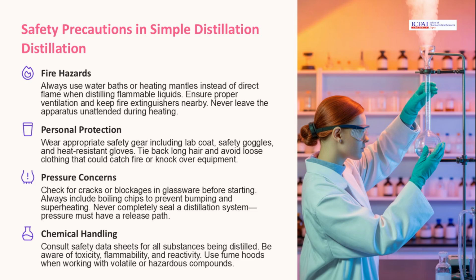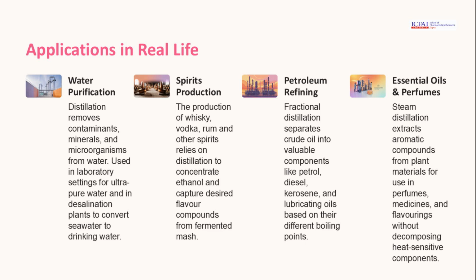Safety precautions in distillation include fire hazard prevention, personal protection, pressure concerns, and chemical handling. Ensuring proper ventilation, wearing appropriate safety gear, and checking for blockages are essential for safe operation. Distillation has diverse applications, from water purification and spirits production to petroleum refining and essential oils extraction. Each application utilizes distillation's ability to separate components based on boiling points, showcasing its versatility.